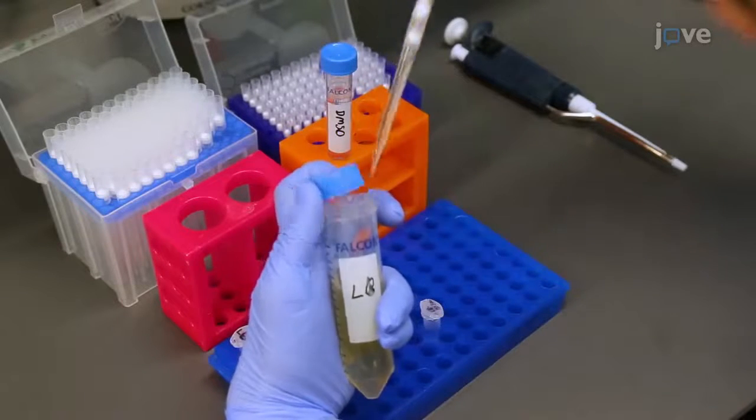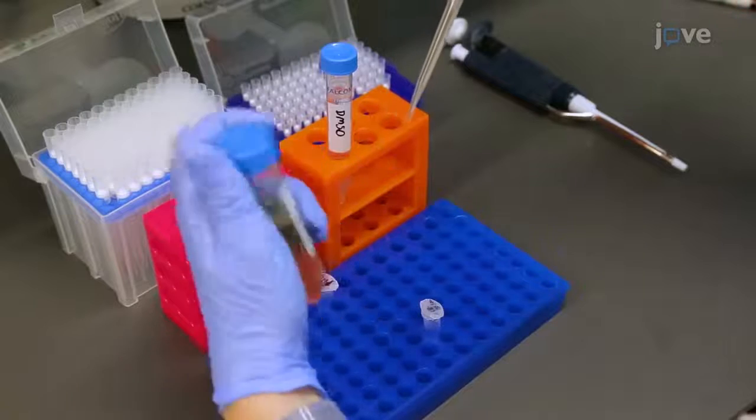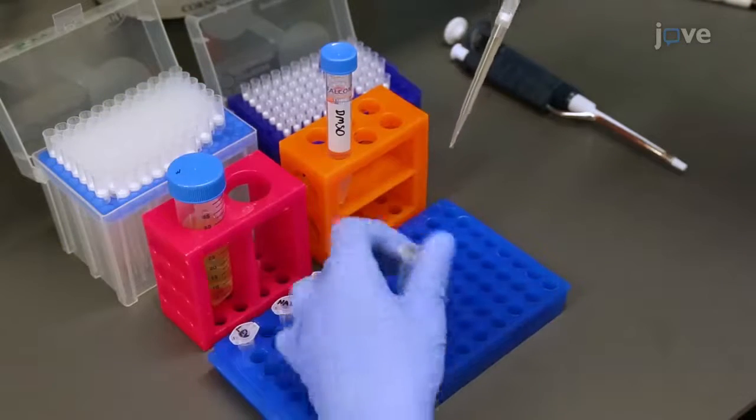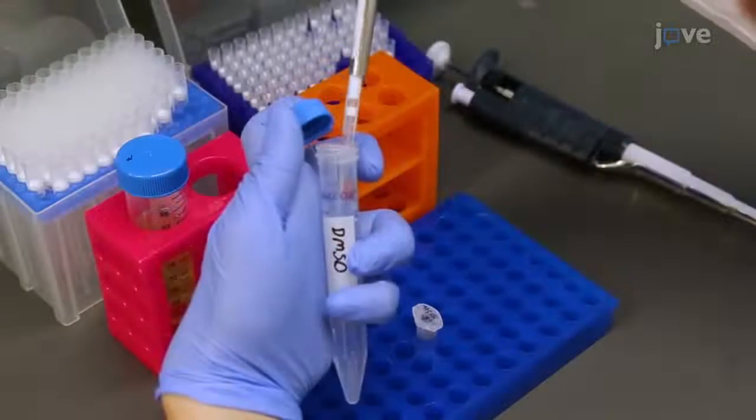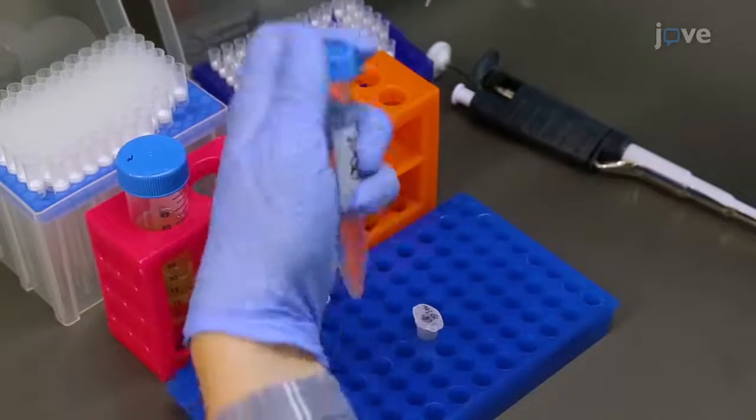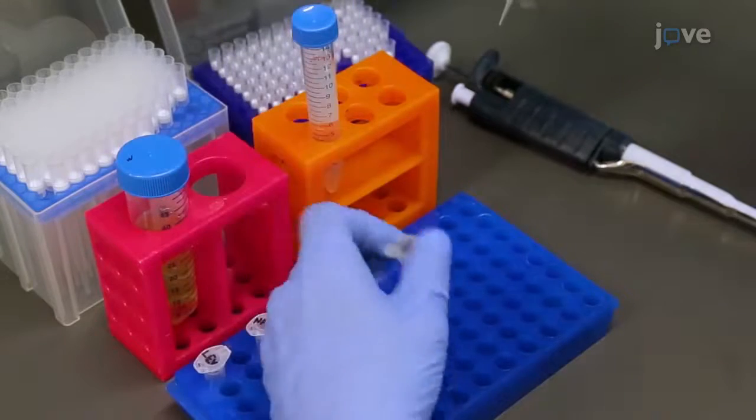To prepare for serial dilutions of these drugs, mix 990 microliters of LB media and 110 microliters of DMSO to make LB 10% sol.